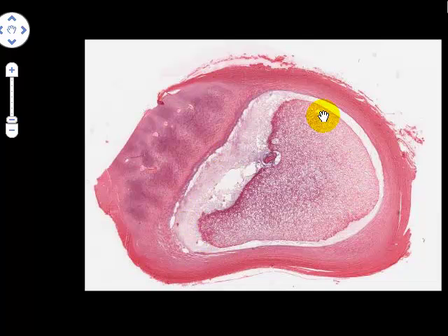We're not really going to examine the structure of the nucleus pulposus. It's sufficient for you to know that it is a jelly-like connective tissue. We're going to concentrate our attention on the annulus fibrosus along here and on this side here. And one thing you should know is that intervertebral discs are closely associated with the vertebrae, the bones between which they're sandwiched, and the surfaces of these vertebrae are covered in hyaline cartilage, and we'll see a big mass of hyaline cartilage just here. Let's zoom in a little bit.